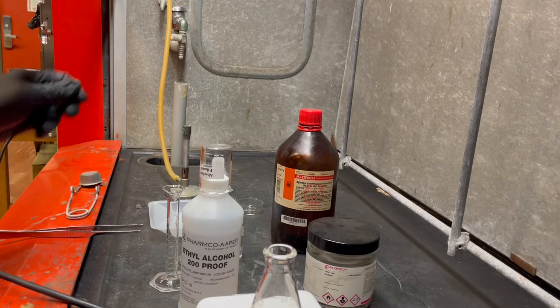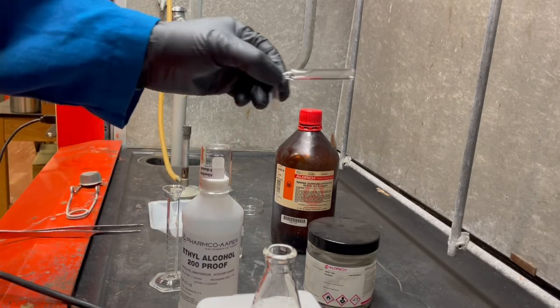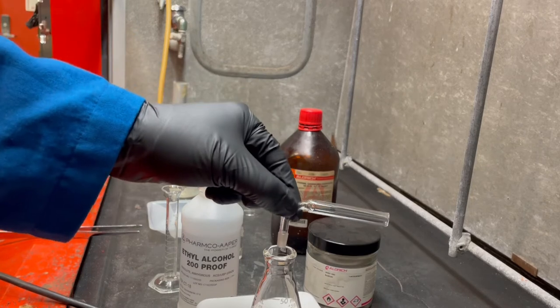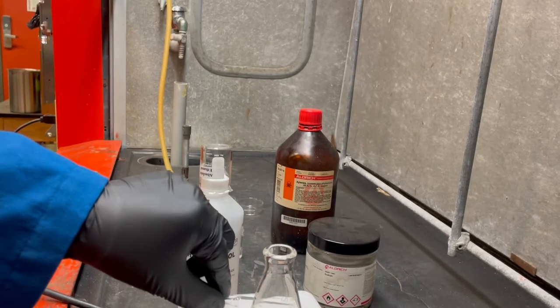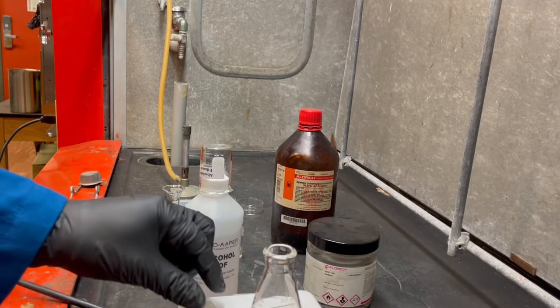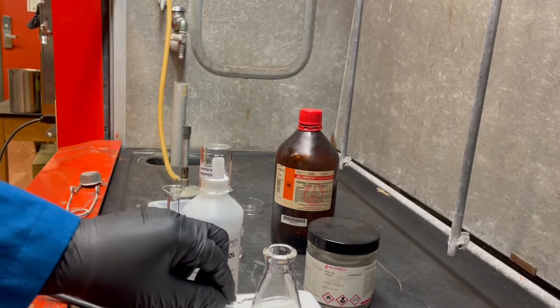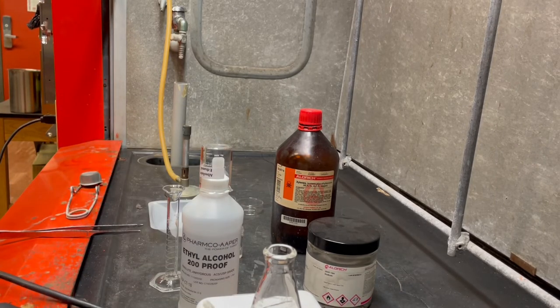What I'm going to do is place this drying tube inside of it. I'll have a stopper right there. I don't want to put the stopper in there yet because it's still hot and I don't want it to melt. And then it's going to have some anhydrous calcium chloride in here, which is going to help keep it dry in there.